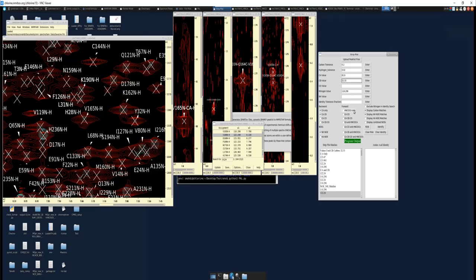You can also go forward by looking at HNCOCAs. So even though we're searching for the I+1 here, you'll notice I had selected the C alpha only and C alpha C beta in the backwards. This is because HNCAs and HNCACBs show you both I-1s and I's, so you can go forward and backwards with them.